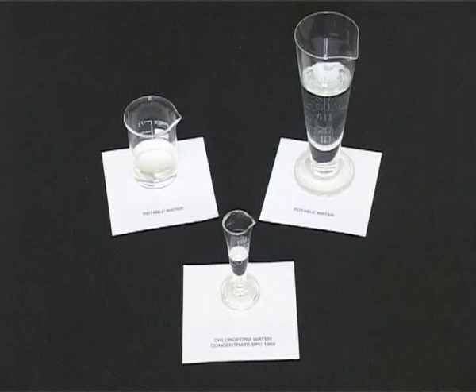Double strength chloroform water is often added as a preservative to oral liquid dosage forms. Originally, it was made using chloroform and freshly boiled and cooled purified water, but nowadays we make it using concentrated chloroform water and potable water.